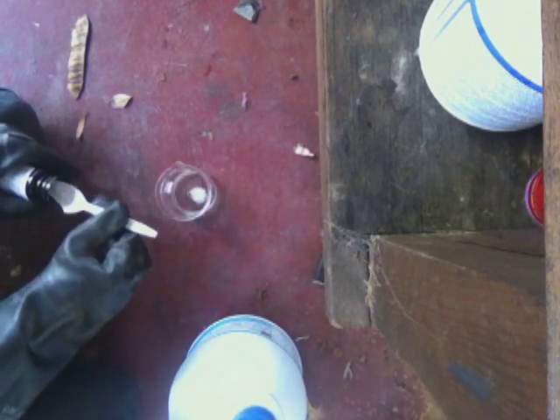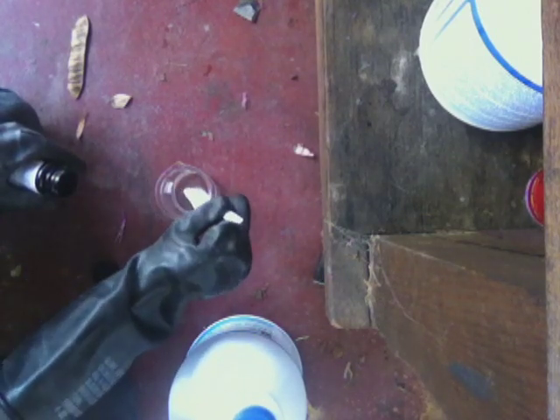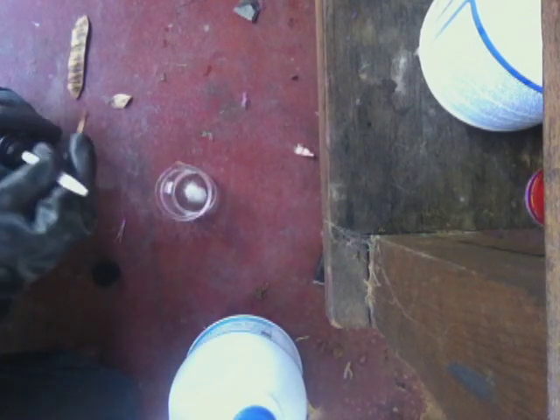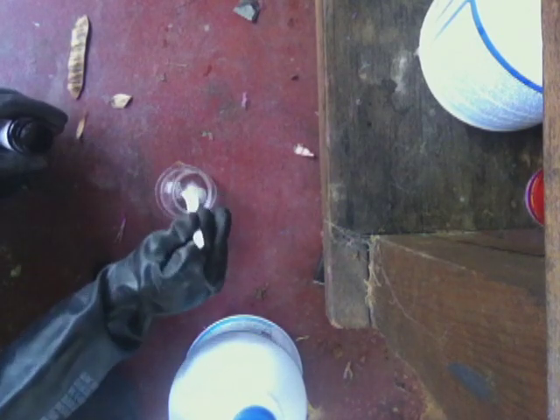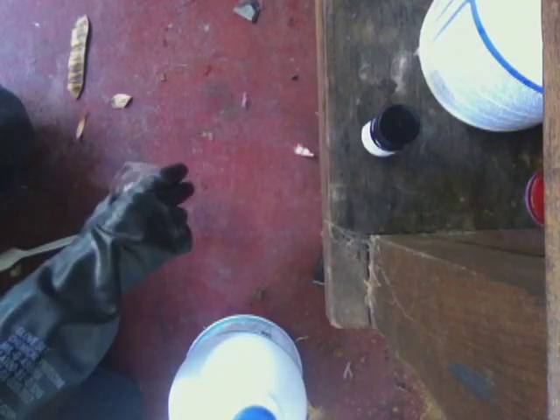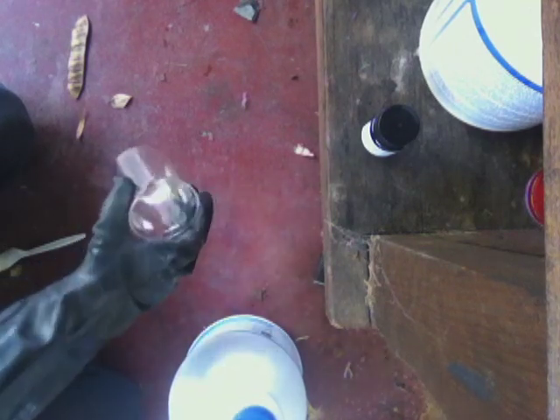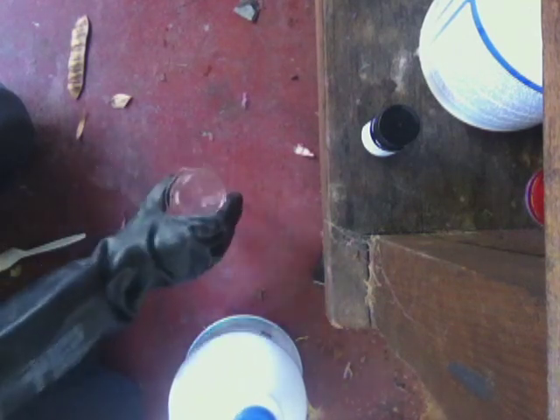I'm going to add about a gram. This stuff is quite water soluble, so you don't need much water to dissolve it — about a gram to this — and just dissolve it up. As you can see there, it's all dissolved, no color change appearance right now.